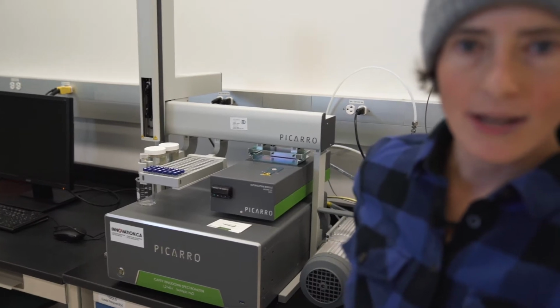Okay, what does this machine behind me do? This machine measures the heavy and light isotopes of oxygen, oxygen 18 and oxygen 16. And the reason that is such an important thing to do in ice cores is because the ratio of those two isotopes gives us temperature in the past.